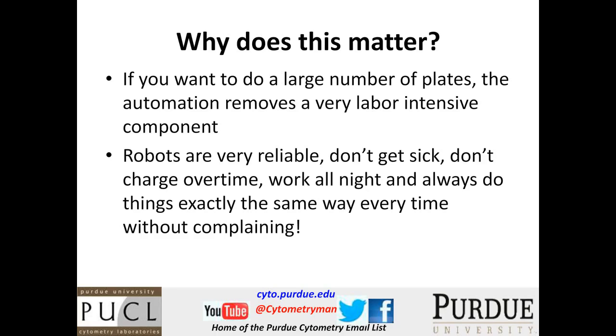So if you're doing preparation of microtiter plates, and I suppose if you have one plate to prepare, then it's probably not worthwhile. But if you have 3 or 4 plates to prepare for an assay, there's no question in my mind that automation improves the quality of the data because the volume distribution is precise.